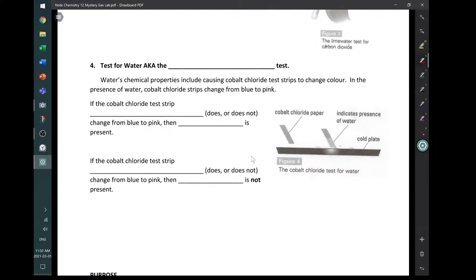And then the last test here involves water droplets. It's a test for water. There are test strips called cobalt chloride test strips. Water's chemical properties include causing cobalt chloride test strips to change color. In the presence of water, cobalt chloride strips change from blue to pink. So if the cobalt chloride test strip does change from blue to pink, then water is present. If the cobalt chloride test strip does not change color, then water is not present.